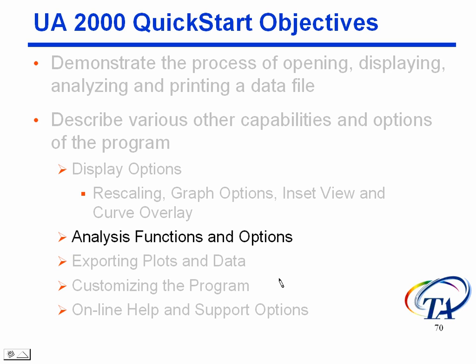Okay, so that's it for the various display options. Let's get into the analysis functions and options right now.